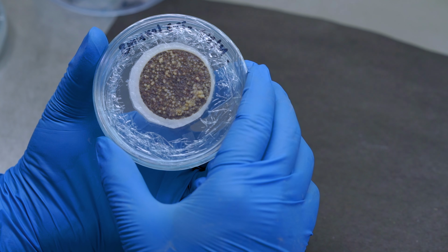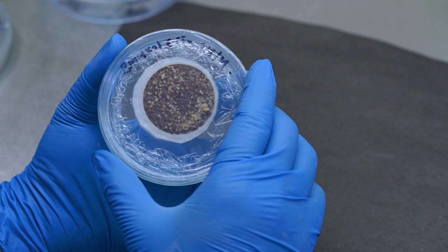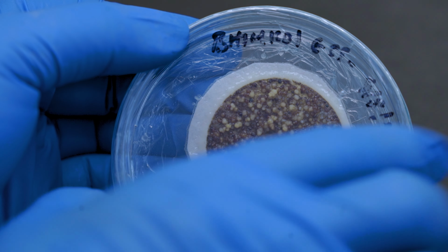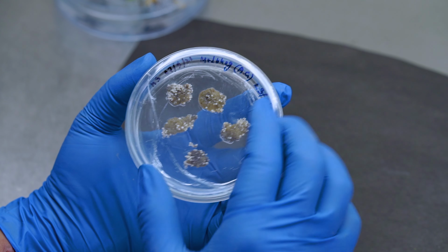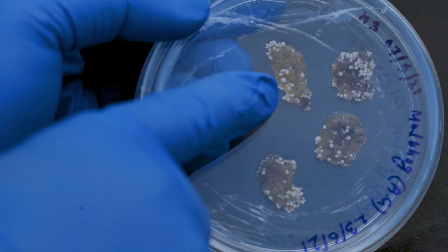After co-cultivating the ECS with the Agrobacterium in co-cultivation media for 2 days, the ECS will start to proliferate, and once you transfer them to a maturation media, the embryogenic cells will give rise to somatic embryos, which we can see over here with the white ones, which are proliferating well in the media.